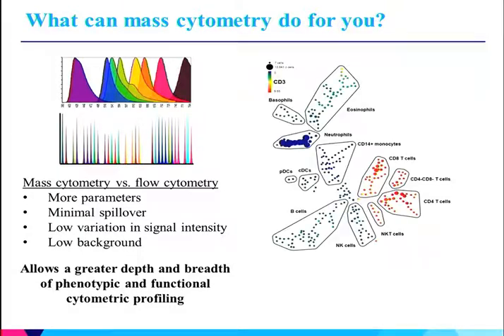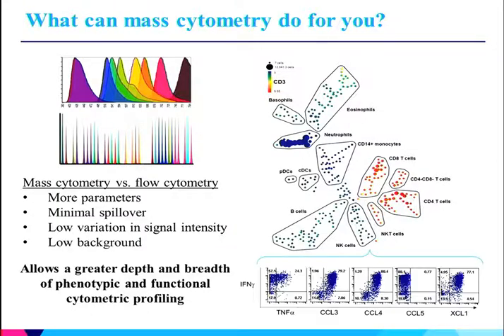So what this means is you can take a heterogeneous sample of cells and dissect that heterogeneity on the basis of phenotypic and functional markers, and again, deeply interrogate cellular function on a single cell level. So this is all very cool, and as Aaron's talk hopefully made pretty clear, and many of our other talks will, you can do lots of really cool stuff with this data.